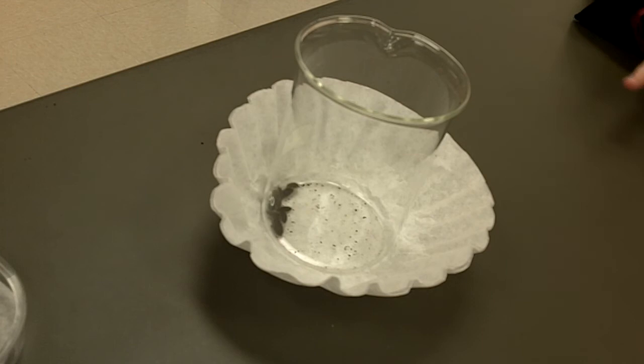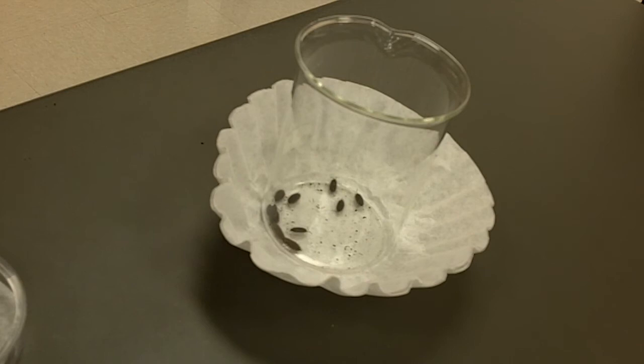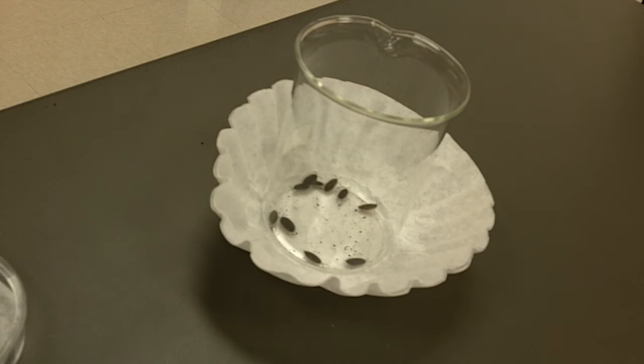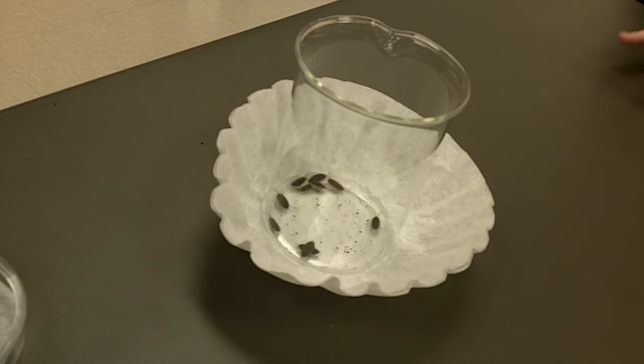You might just want to describe that as part of your methods, that they were kept in chambers, in the lab, they were chosen at random. What I do is I spritz them every morning and then before I leave on the weekends. We can talk about whether we want to feed them carrots or potatoes as a food source. But as long as we keep it the same throughout the experiment, like if we decide we're going to feed them potatoes, then we need to feed them potatoes throughout the entire experiment. Probably what I'll do is start adding them potatoes. So that's probably going to be our choice. Our constant with them being in their chamber will be the potato.